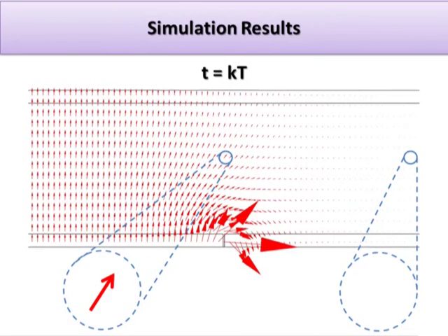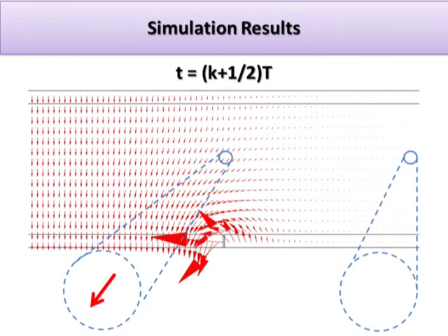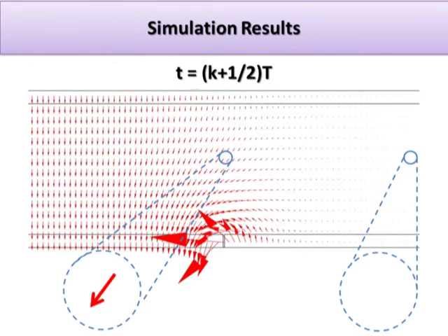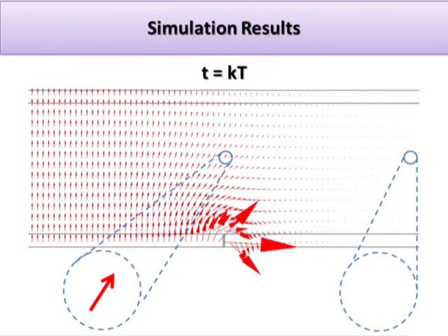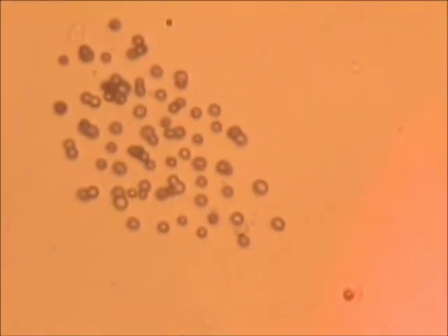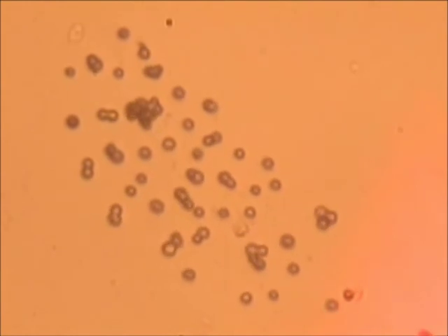As the slide shows, a rotating electric field exists in the area nearby the light projection boundary. In the area away from the boundary, the fields only change the amplitudes along one direction. When the light boundary is near a cell, a rotating electric field is induced, hence rotating the cell. Using this method, the team can rotate a lot of cells simultaneously.